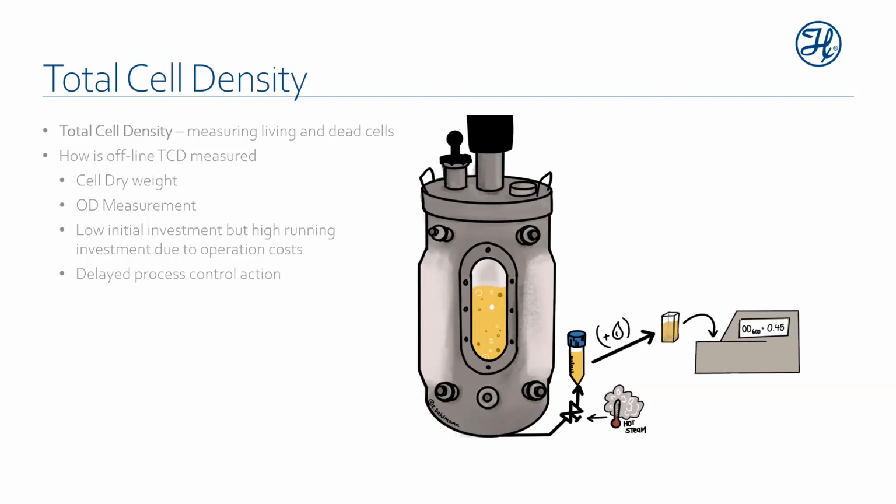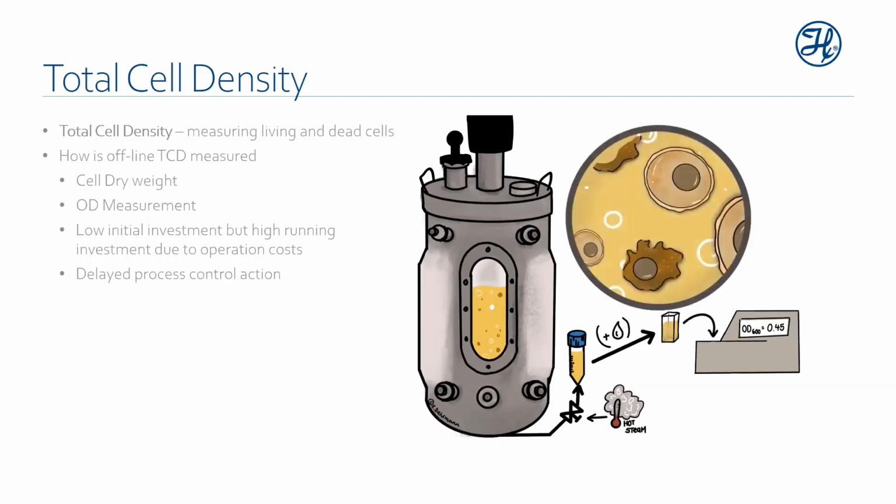So, okay, I do that, I get a measurement. And that measurement is typically done by determining the amount of light that is deflected from a given incident source. And this in the bioprocess is typically going to be cells as well as cellular debris will contribute to the amount of light that passes through and is received on the detector end. And this is the basics of the measurement principle for offline UV-vis spectrophotometry.